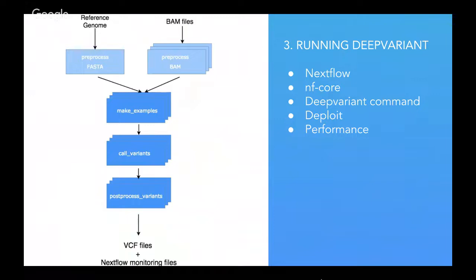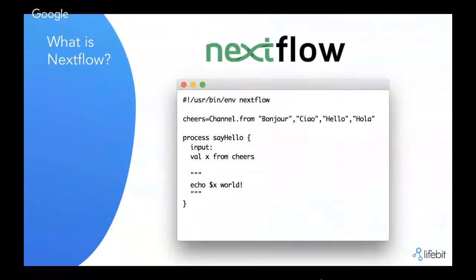For that we are using Nextflow as a workflow management language and system. We'll also present a publicly available pipeline that uses Nextflow and DeepVariant, which has been published in the nf-core community. Then we'll show you how this is run in production. So I'll hand over to Phil Palmer, our bioinformatician, who will follow up with this part, presenting DeepVariant. Okay, yeah, I can take over from here.